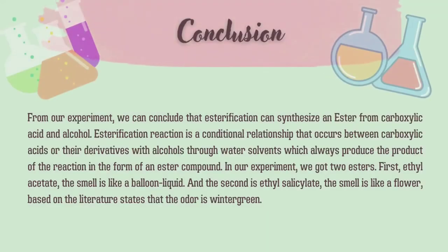From our experiment, we can conclude that esterification can synthesize an ester from carboxylic acid and alcohol. Esterification reaction is a conditional relationship that occurs between carboxylic acid or their derivative with alcohol through water solvent, which always produce the product of the reaction in the form of an ester compound.